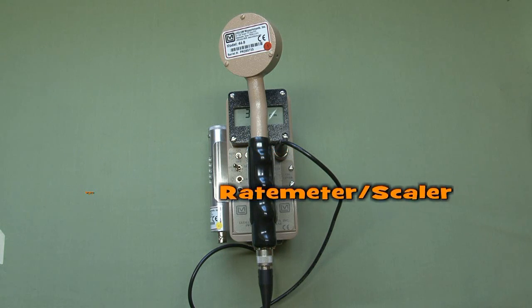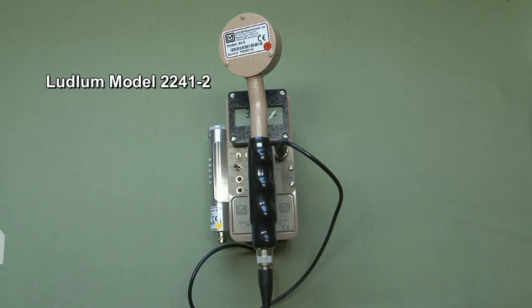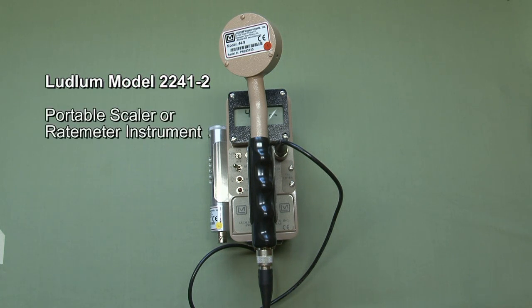Hi, this is an overview of the Ludlum Model 2241-2 survey instrument. This is a portable microprocessor-based digital scaler ratemeter instrument.